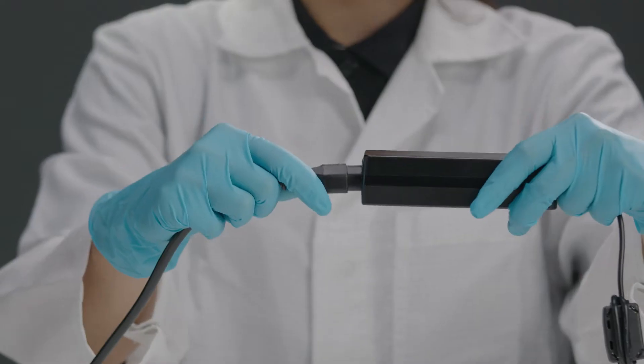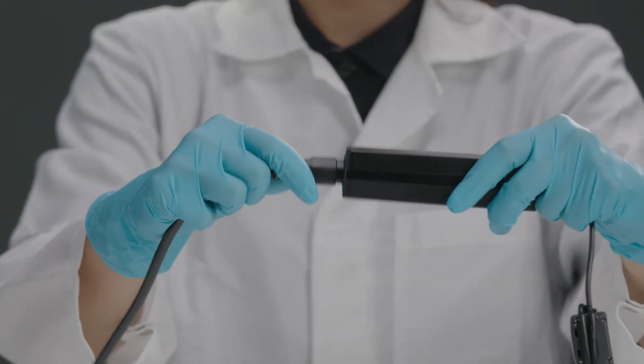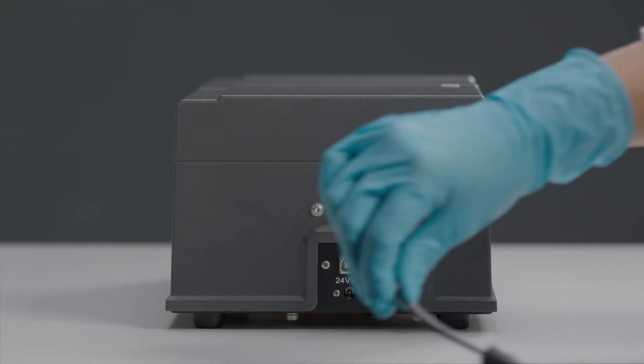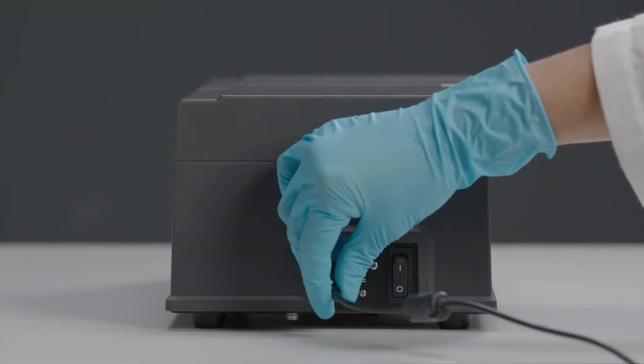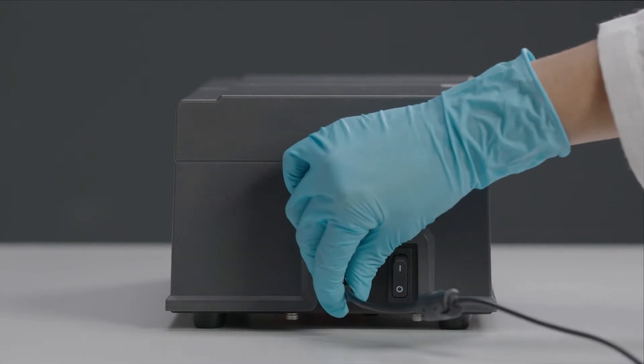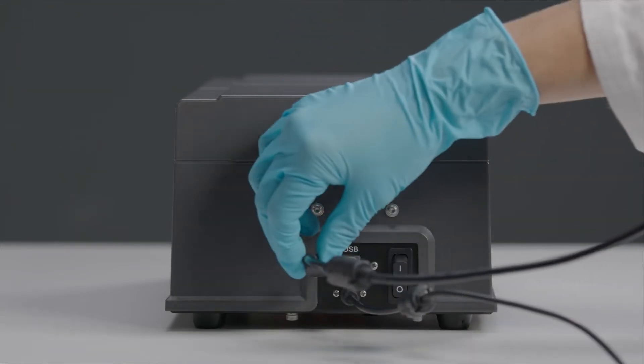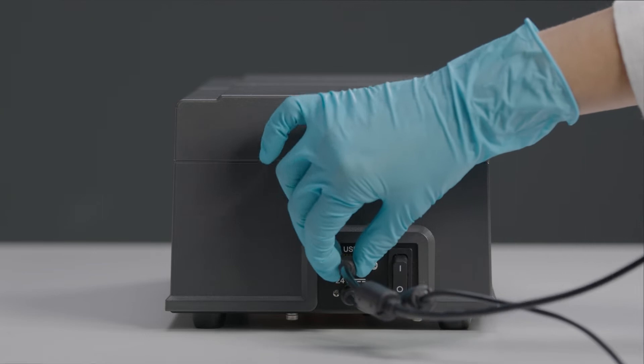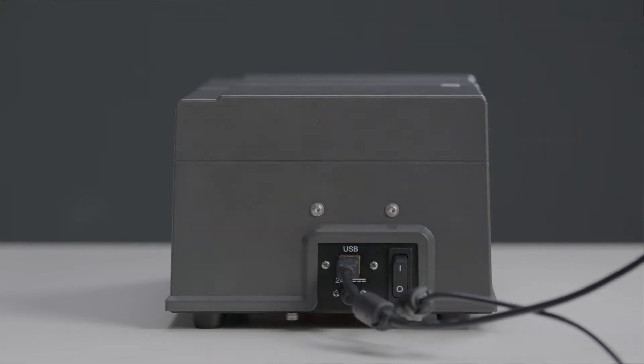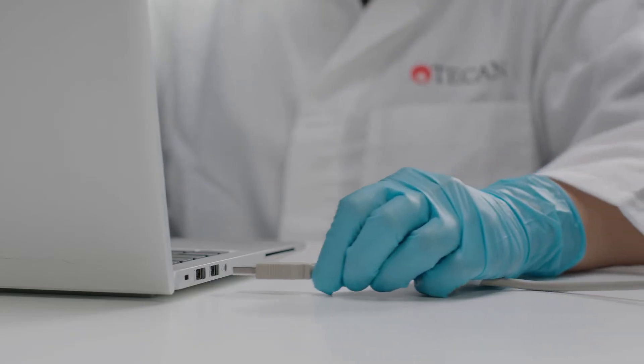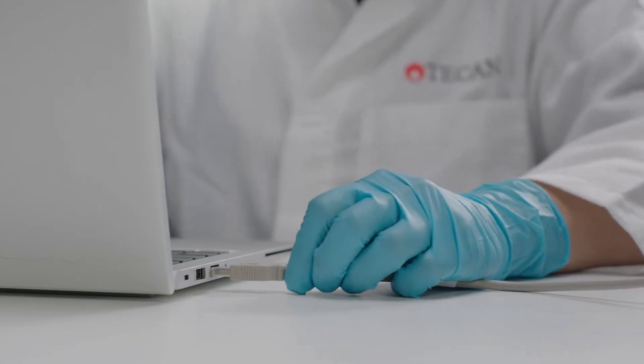Firstly, assemble the power cable and connect it to your device. To connect to your PC, take the USB cable and plug it in right next to the power cable. The other end goes into your PC.